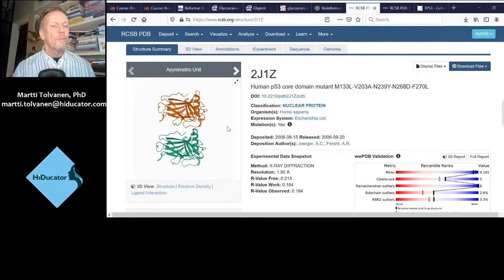There is not enough protein-protein contact to make this a dimeric thing. So the space in between is mainly filled with crystallographic water, or crystal-containing water. It is typical for protein crystals to be 50% water and 50% protein.